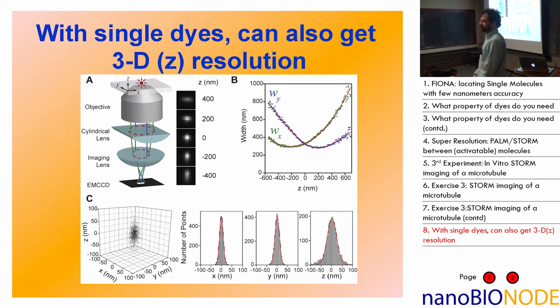But the calibration curve for Z is not linear, right? Yeah, maybe. In general, I think it is nonlinear, but it's whatever it is when you move a microscope or you move a fluorophore 200 nanometers and then 300 nanometers. It's whatever it is.